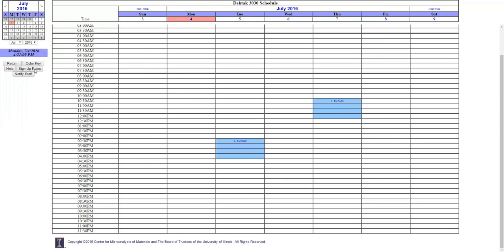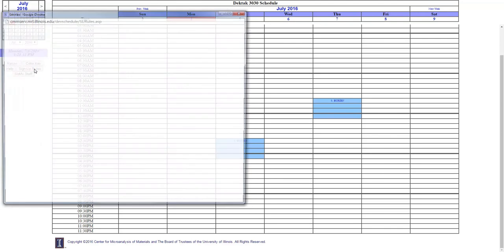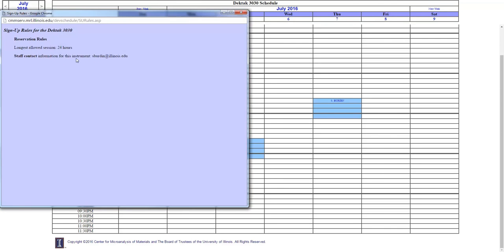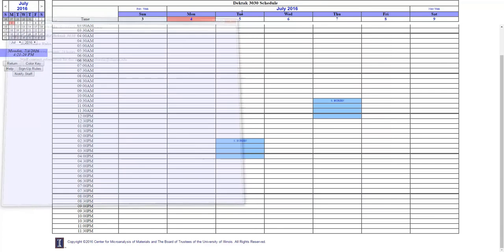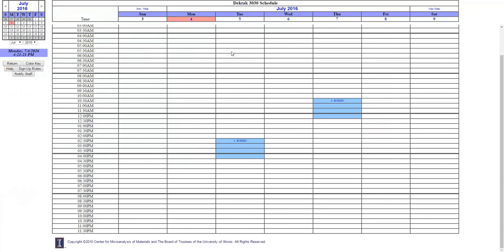The Sign Up Rules button will tell you about special restrictions on the instrument sign-up, for example, the longest allowable session, and who the email addresses of the staff who are in charge of the instrument are.